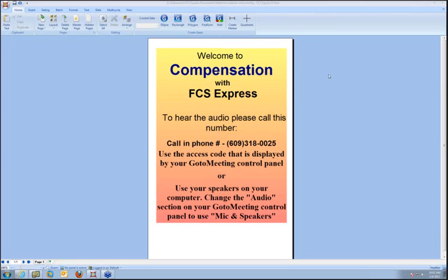The webinar today will be about half an hour, and we will be going over all of the new compensation features that we have in FCS Express. We've spent the last few months rewriting most of the user interface associated with compensation to make it easier to use, based on a lot of customer feedback. So we're really glad to be able to show this off publicly for the first time.